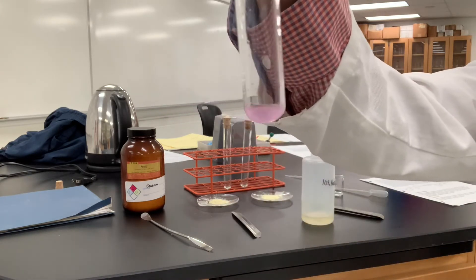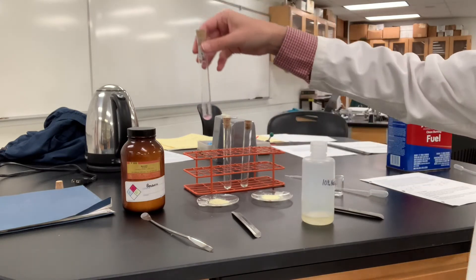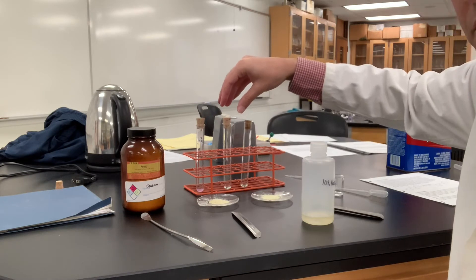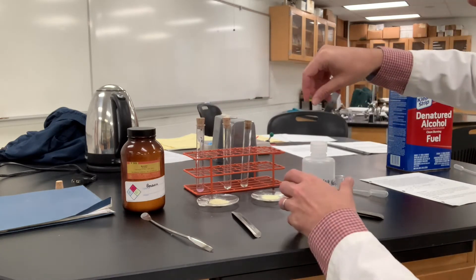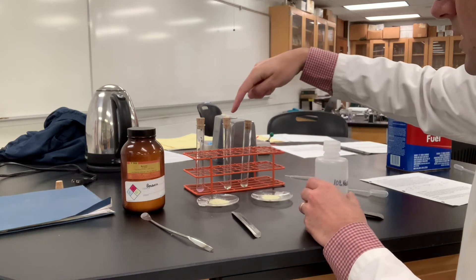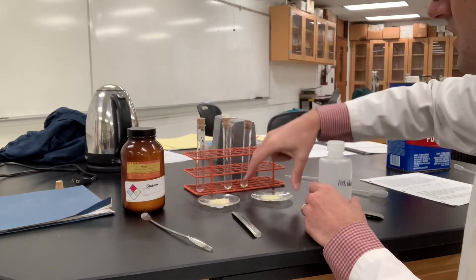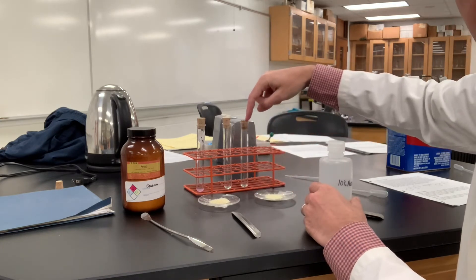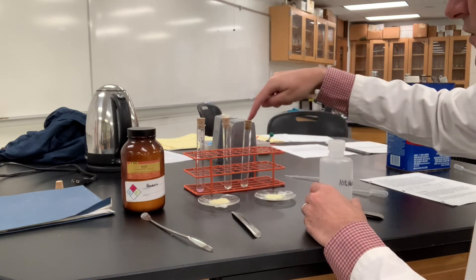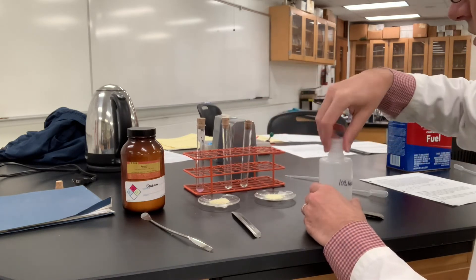We don't need grams and grams of material — just half a milligram and a little bit of ethanol to see that. Now when you do benzyl, it's pretty cool. Let me show you what happens. I'll do these side by side. The test tube in the middle is the copper acetate catalyzed reaction, and the test tube on the right is the copper nitrate. I might mix them up in the video, but just remember the smaller test tube is copper nitrate and the taller one is the copper acetate.